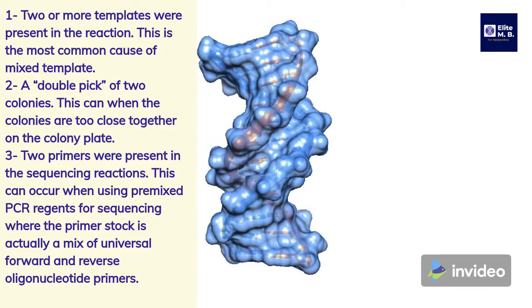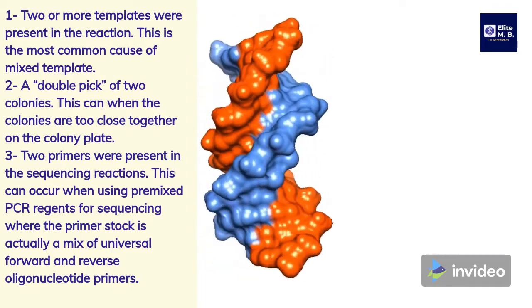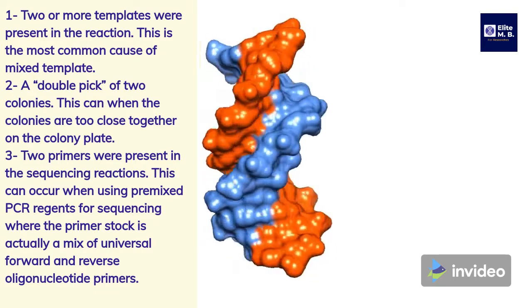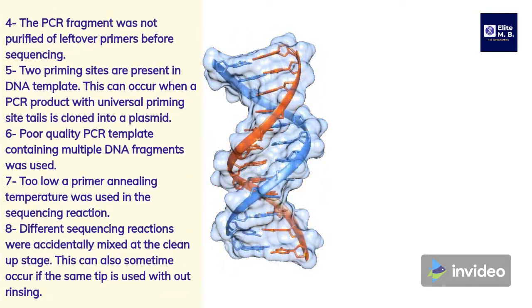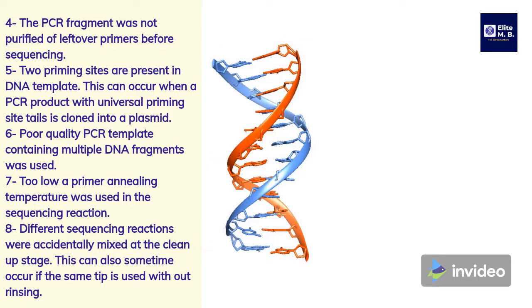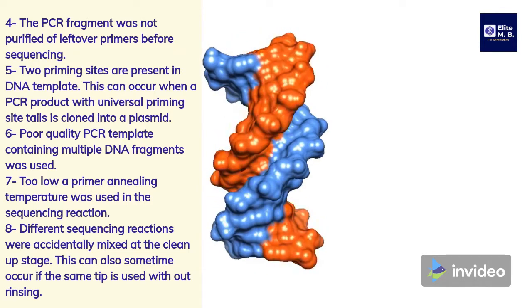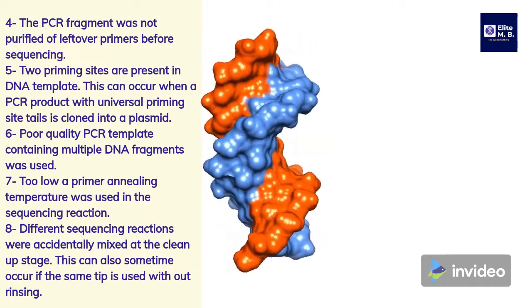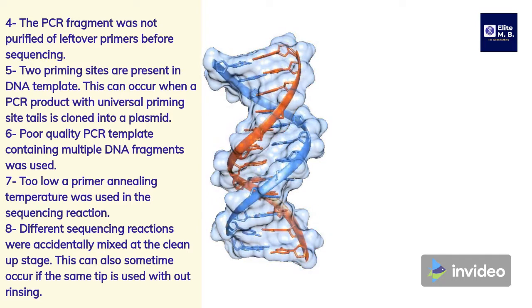Two primers were present in the sequencing reactions. This can occur when using premixed PCR reagents for sequencing where the primer stock is actually a mix of universal forward and reverse oligonucleotide primers. The PCR fragment was not purified of leftover primers before sequencing. Two priming sites are present in the DNA template — this can occur when a PCR product with universal priming site tails is cloned into a plasmid.